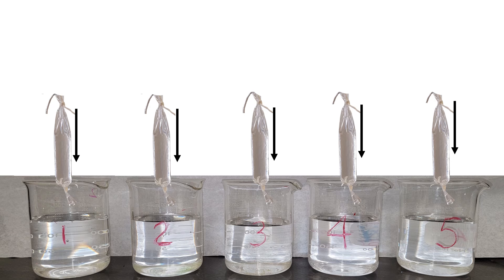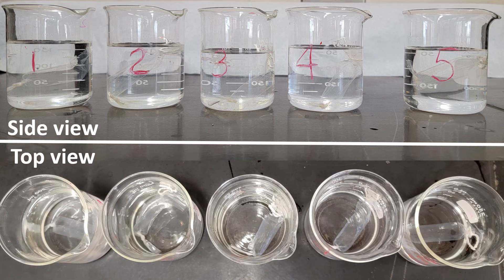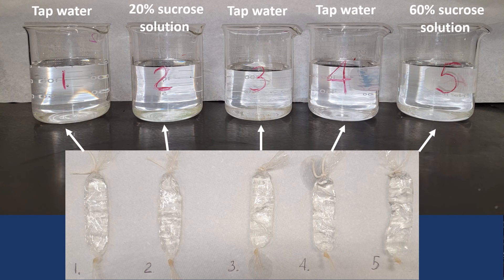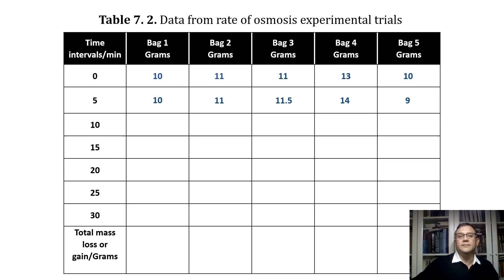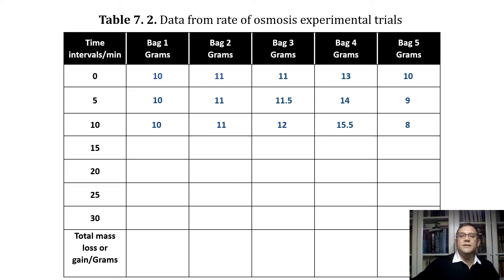Now, once again, submerge all the bags simultaneously into the beakers and leave them there for another five minutes. After the five minutes, simultaneously remove all the bags from the beakers. Place each bag next to its corresponding beaker and then one by one measure the mass using the laboratory balances. Record the results in our data table. Here it is for bags one, two, three, four, and five.